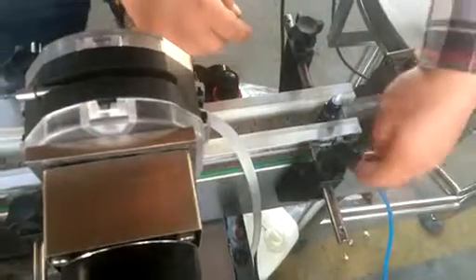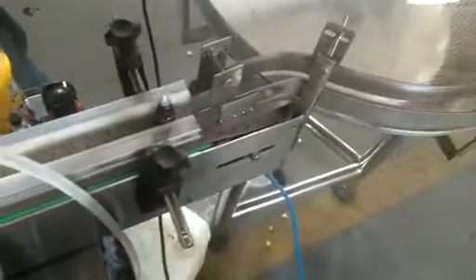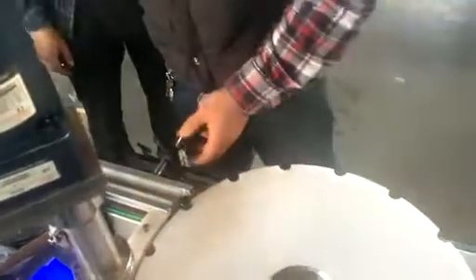Let's go in there. So you adjust one part and then you lock it. And then you go to the other side. You adjust there and lock them too.